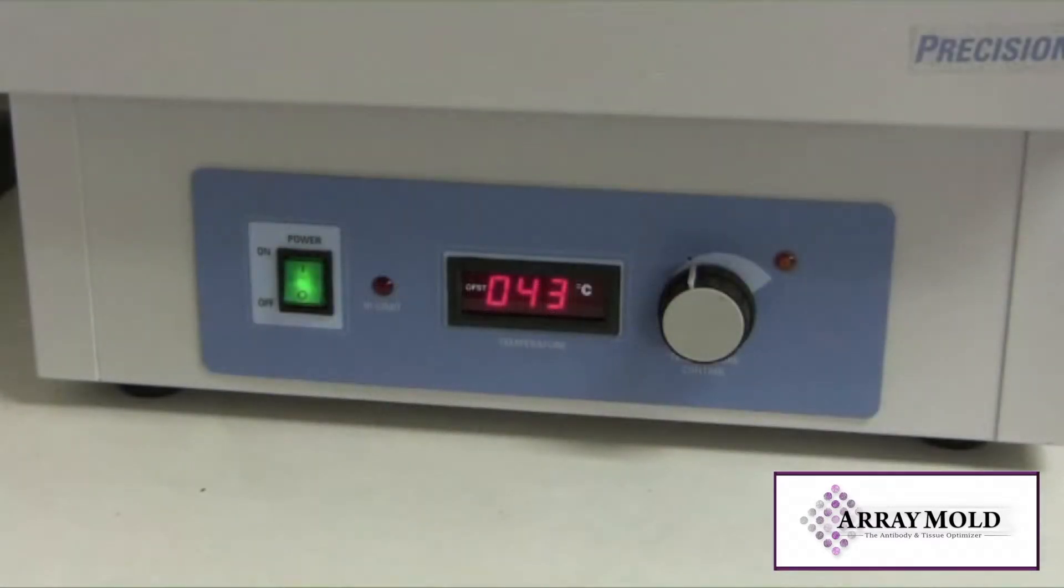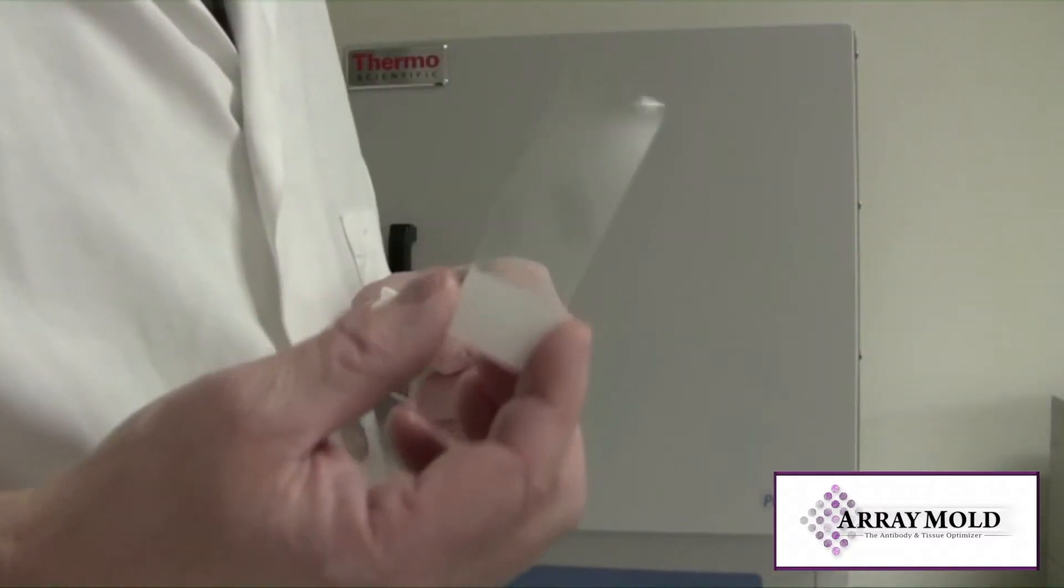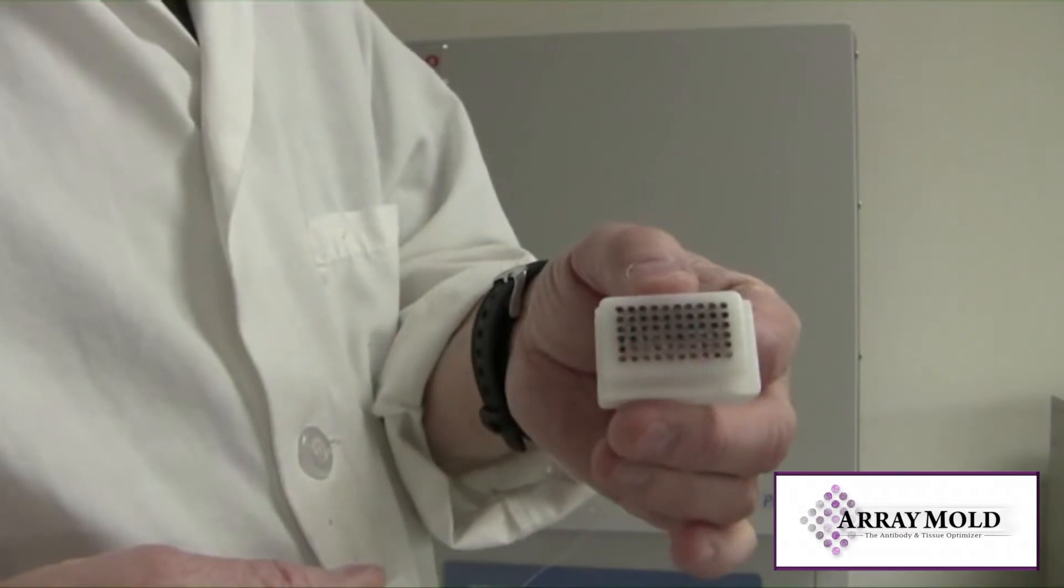Warm an oven to around 43 degrees Celsius. Place the array block on a glass slide face down. It doesn't matter if it's a charged or non-charged slide.